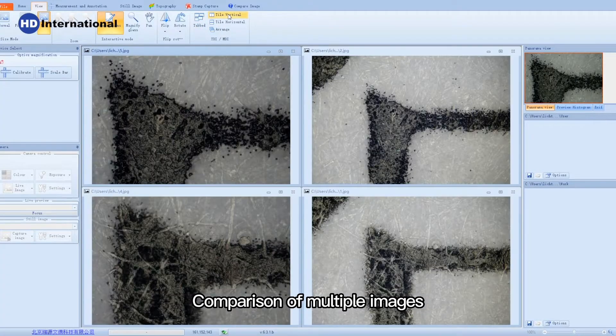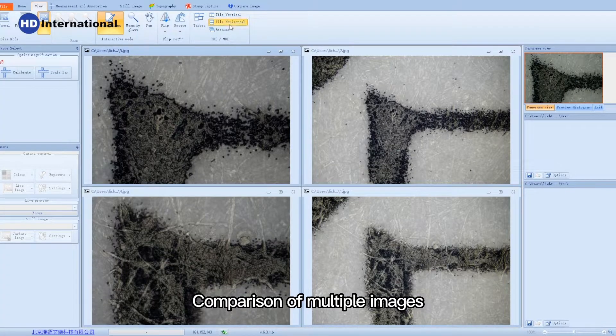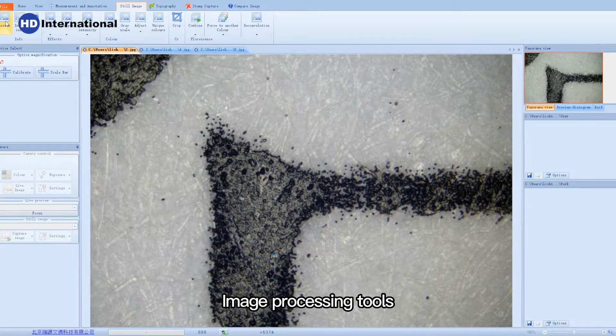Features include comparison of multiple images and image processing tools.